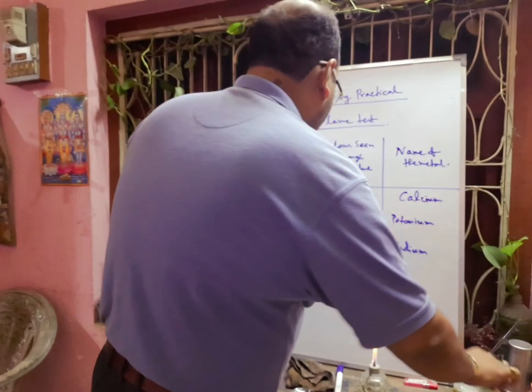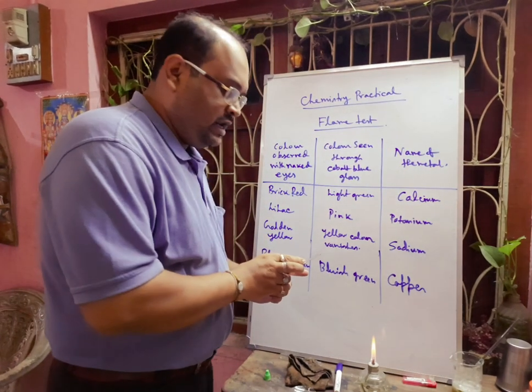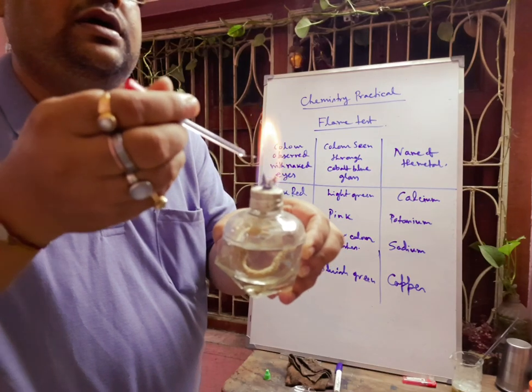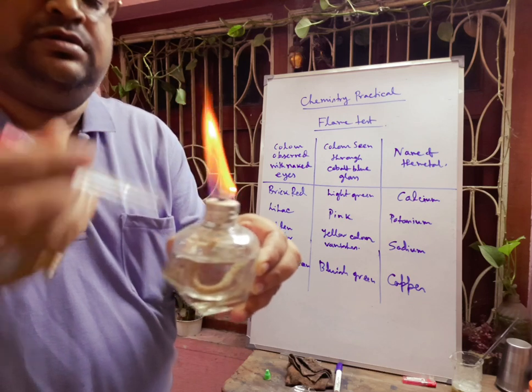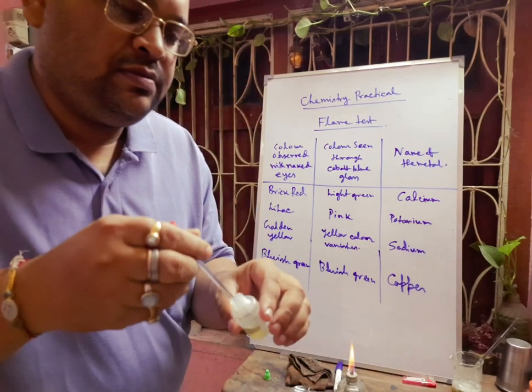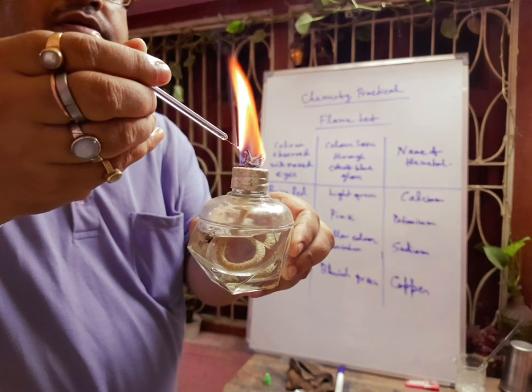Next, I will take some potassium salt, dissolved in HCl. When you observe with the naked eye, you will see a lilac or violet color. Here you can see that potassium is showing some violet color — this lilac or violet color is coming. This is called lilac or violet color.